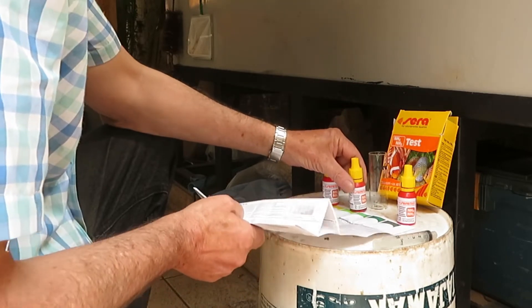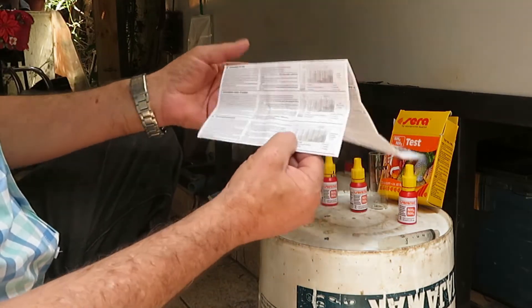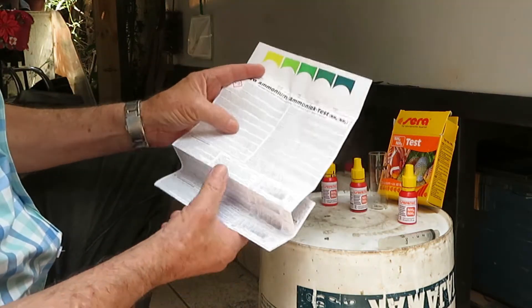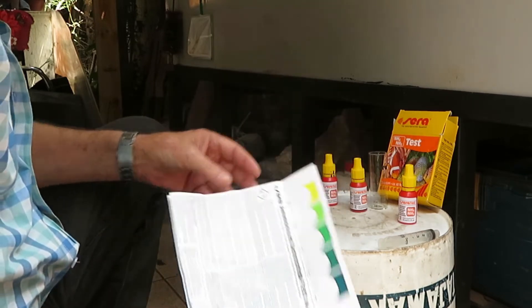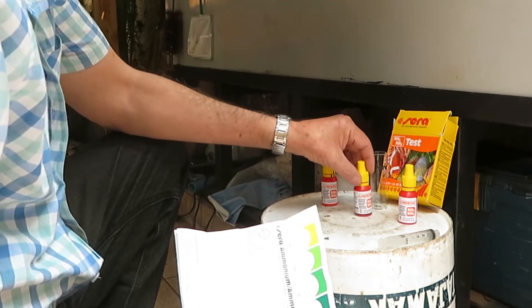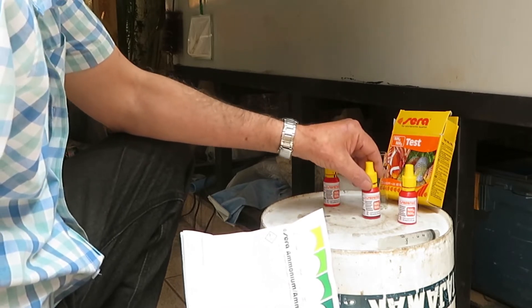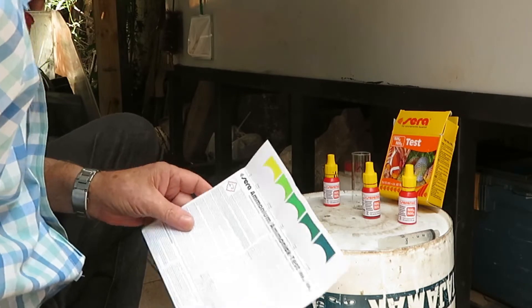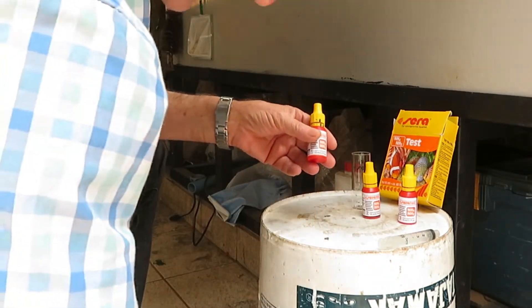The kit also includes instructions on how to carry out the test and a warning about the hazardous chemicals contained in the flask. Additionally, these bottles have child-proof caps.